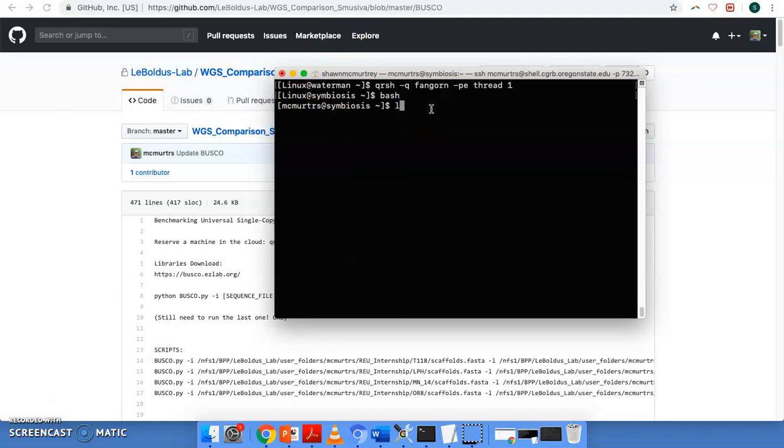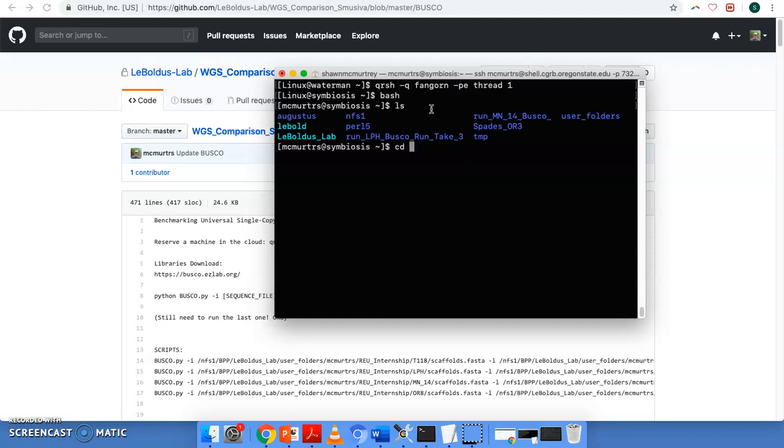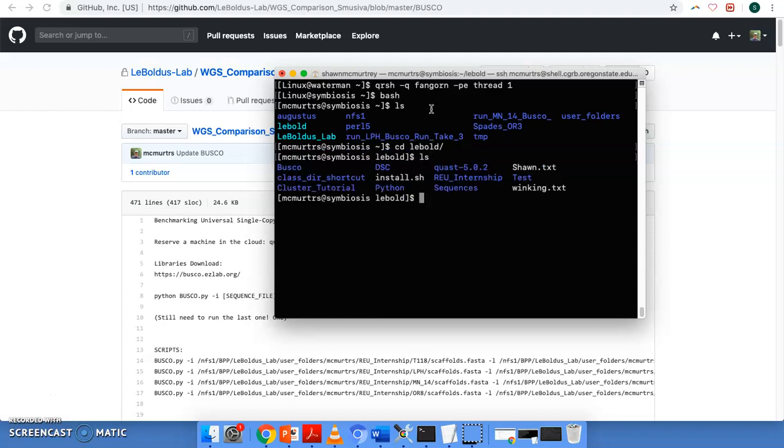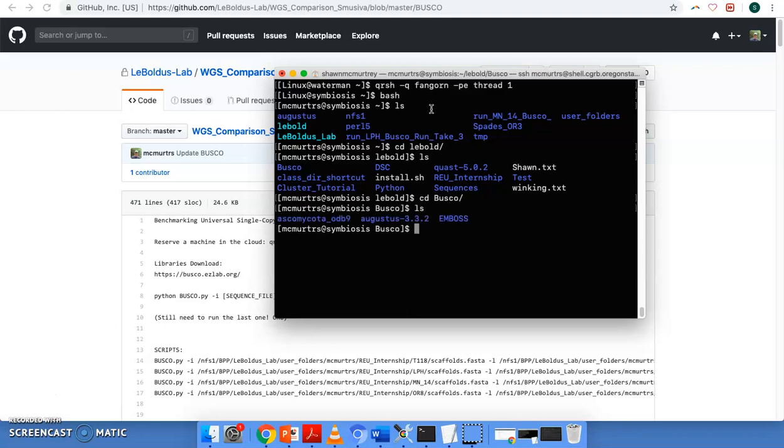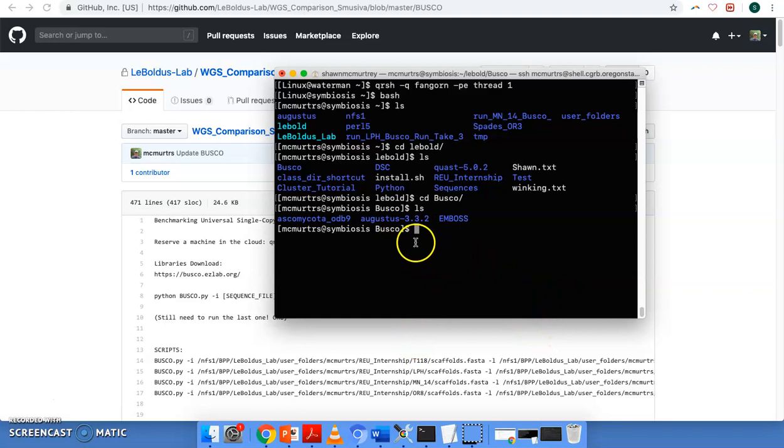And we're going to see where we're at. We want to move to the directory that we want our output to be into. So we're going to cd to busco. Okay, so yeah, we'll go ahead and put the output of this run into this directory here.